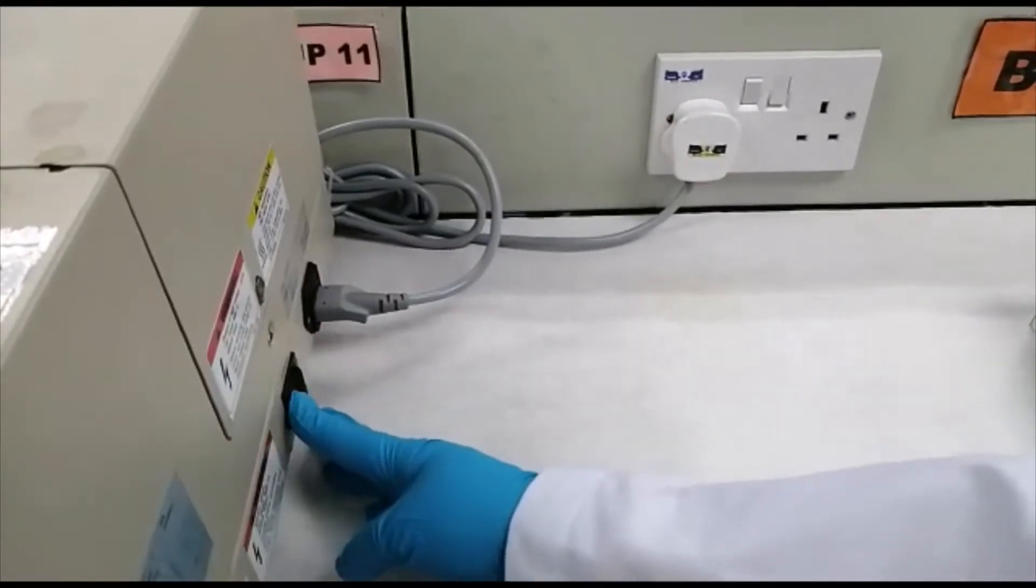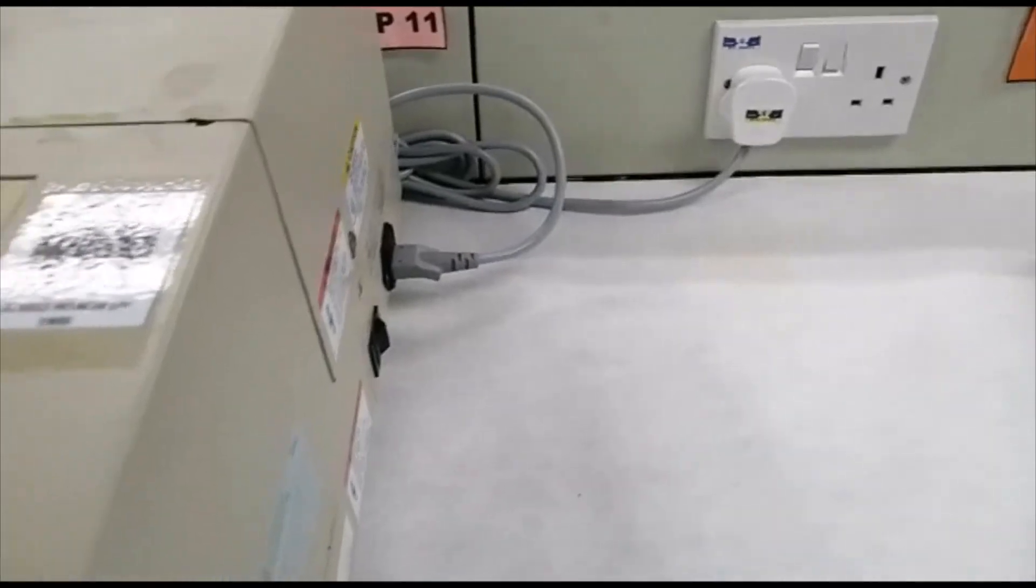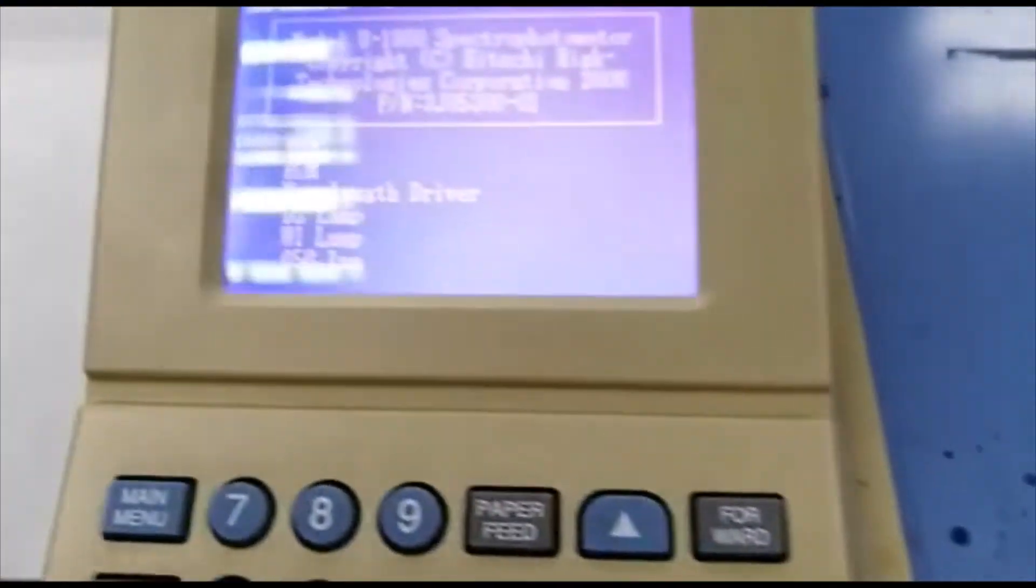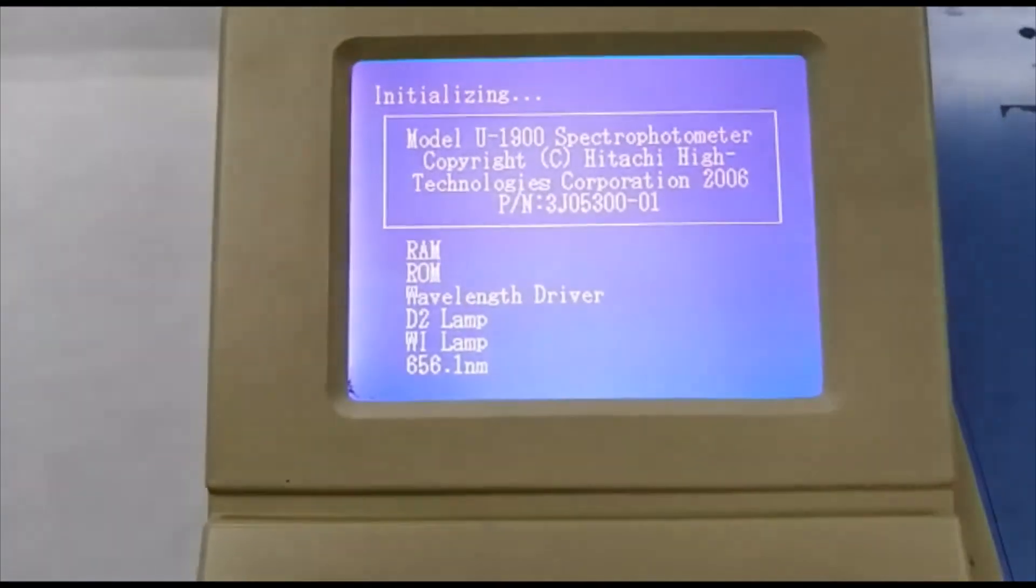Fontan Suisse Alat. Biarkan warm up lebih kurang 10 minit.